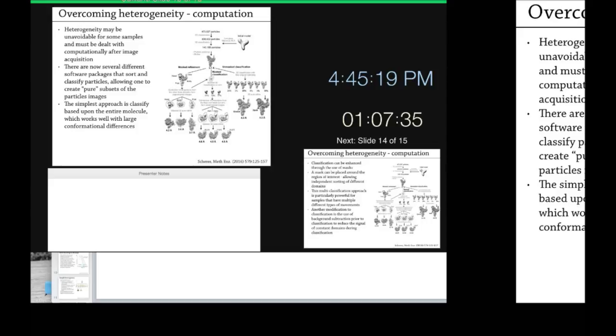For example, I work with ribosome, and in some cases we work with the small and large subunits, and there's a line between, and we can also recognize the top view and bottom view, so we can remove everything that's not that. But what if you have a large conformational change and only 5% of your particles have that conformational change, and you do 2D classification? Do you think you'll still be able to see those nice views if they're only a small fraction of the data set? Yeah. No. That's the issue with 2D classification: everything that's very highly abundant, you'll get back.